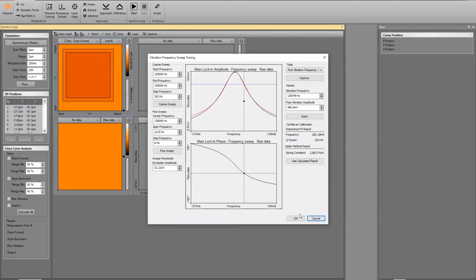Next question. How do we choose the scan size in case of polymer solutions? That's a good question. A lot of the parameter settings is empirical. So what kind of Z range do I use? I'm not sure whether they meant Z range or the XY range.